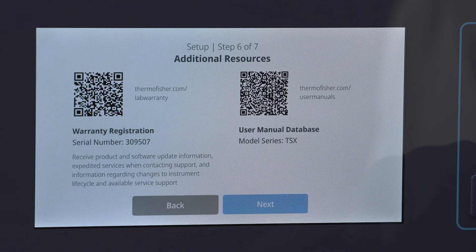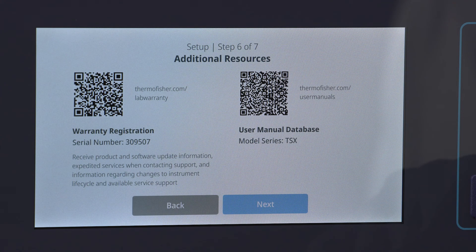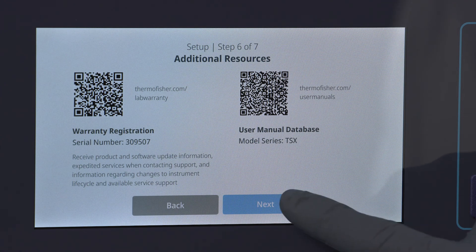If you need additional support information, there are QR codes in the startup wizard and the files and info section within settings that can link to helpful documentation such as the user manual.